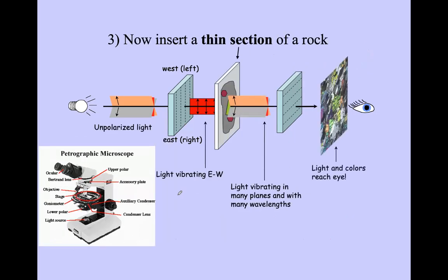Right. So now we have put a sample in between. That means on the stage there is a sample now. Now you have the sample, the thin section, here. You know these thin sections contain so many types of minerals, right? Quartz, feldspar, tourmaline, topaz, many types of garnet, many types of minerals. So their properties are different. And I think I mentioned last time that one category of mineral is called isotropic and the other category is called anisotropic. Probably you can remember.